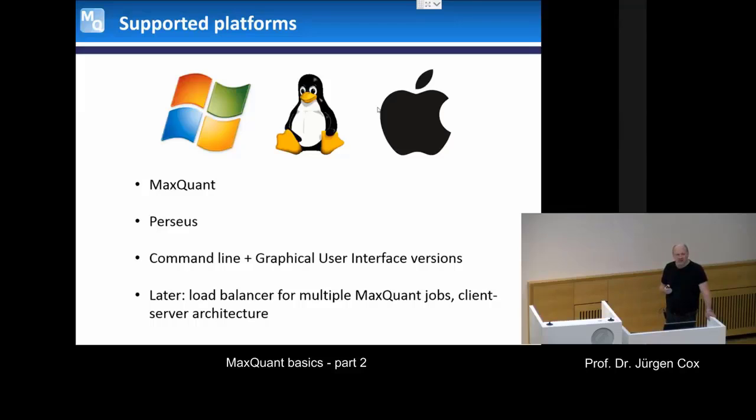The speed is maybe a little bit slower than on .NET Windows. That's just because, of course, it was all developed first on Windows and optimized there, and then people reprogrammed it on Linux and tried as well as they can to achieve the same performance. But it's also performing quite well.